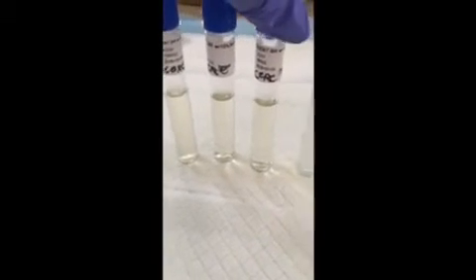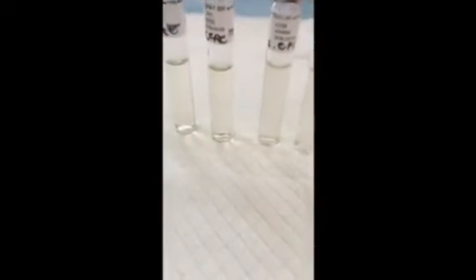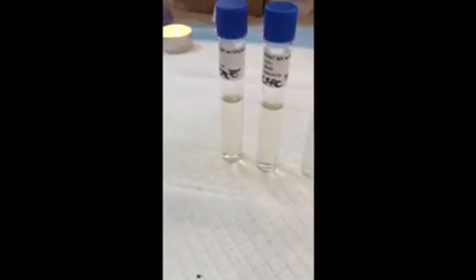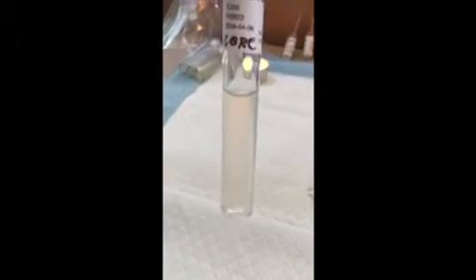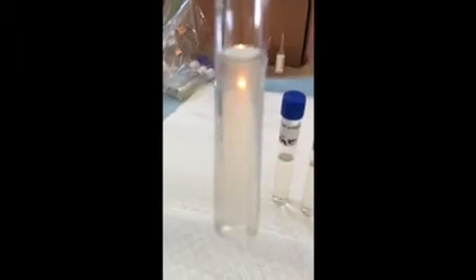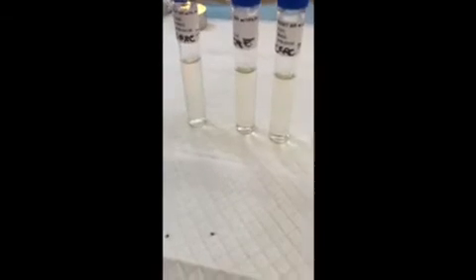Same with the Epi, 15%, it's clear as well. But take a look at the 6 ml, 6%. It's a little bit turbid, it's positive. And the 1% for the Epi, there's more turbidity too.